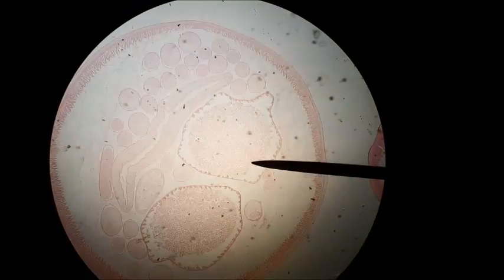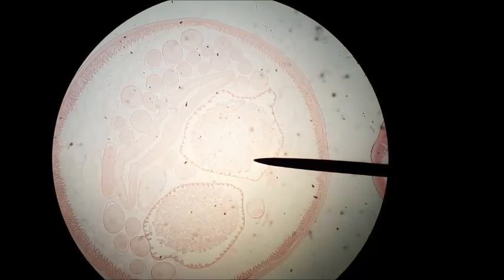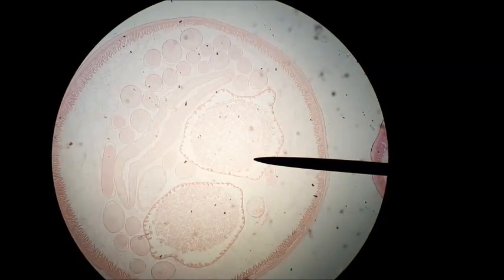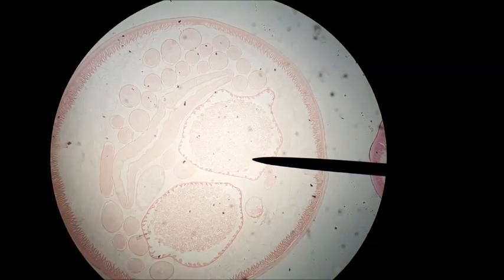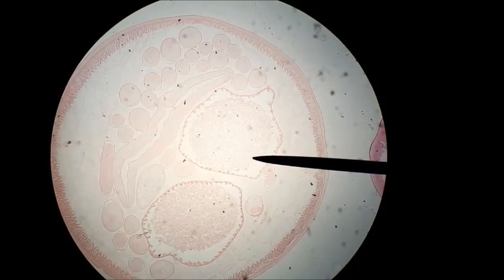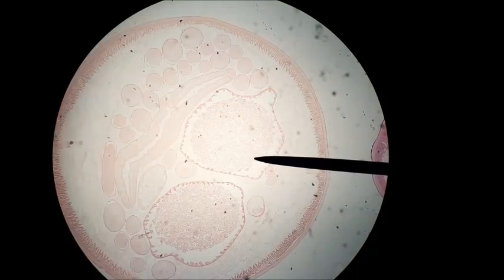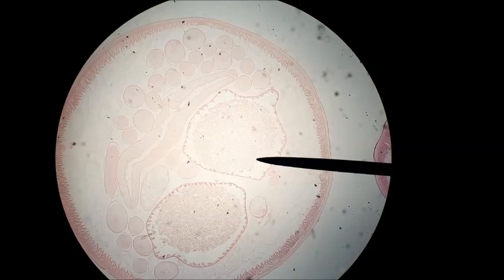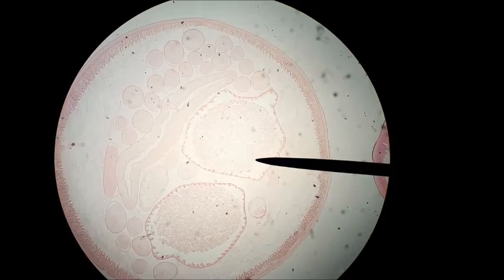To the left there's a long flattened area. I believe that's the central gut. All these little round things—that's what I thought in the other picture might be the testes, but this is obviously a female, so not likely that even those round circular elements were testes even in the male.